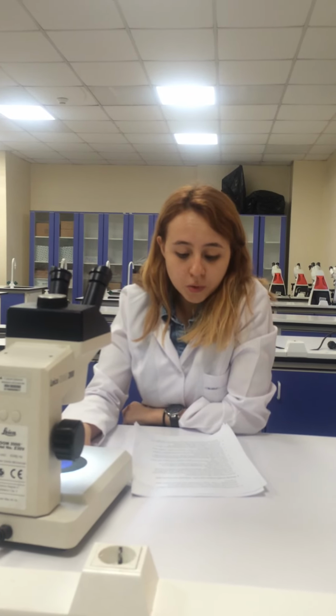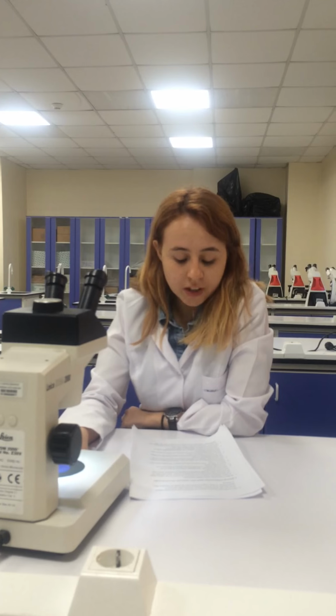The sixth step is staining of differentiated adipocytes, osteocytes and chondrocytes. First is oil red O staining for differentiated adipocytes. At day 9, adipocyte maintenance medium is removed from 6-well culture plates with differentiated adipocytes, and the plate is washed twice with PBS. Adipocytes are fixed with 10% formalin solution for at least 10 minutes. The formalin solution is removed and the plate is washed twice with double distilled water.